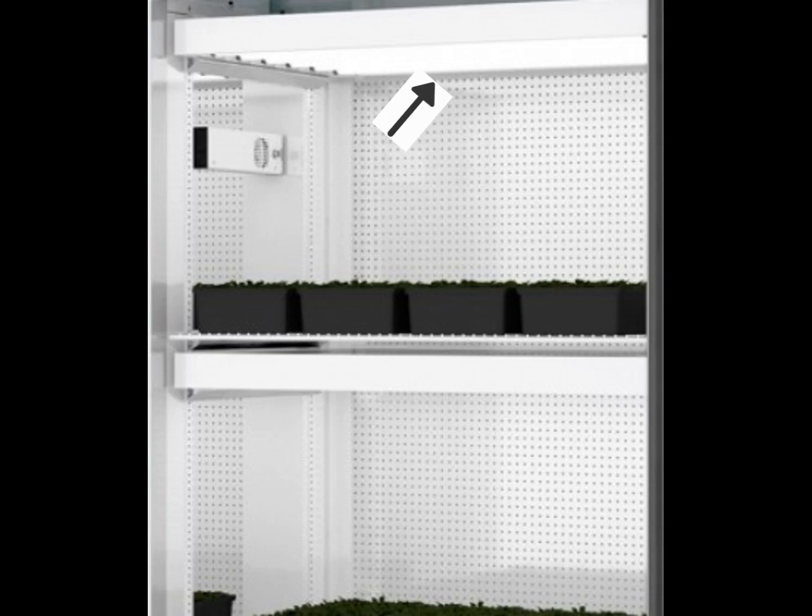And what I got was some fluorescent lights. This chamber uses very, very bright fluorescent lights because fluorescent lights are capable of emitting a large range of wavelengths, which is key when you need to customize light settings and you need a very specific brightness and color for the light that you want to grow your plants under.